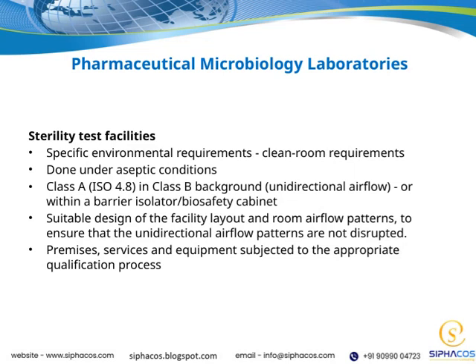Let's now look at the pharmaceutical microbiology laboratories, specifically the sterility test facilities. These areas have very strict environmental requirements, including cleanroom standards, to ensure the integrity of the testing process. It's crucial that all procedures are performed under aseptic conditions to prevent contamination.